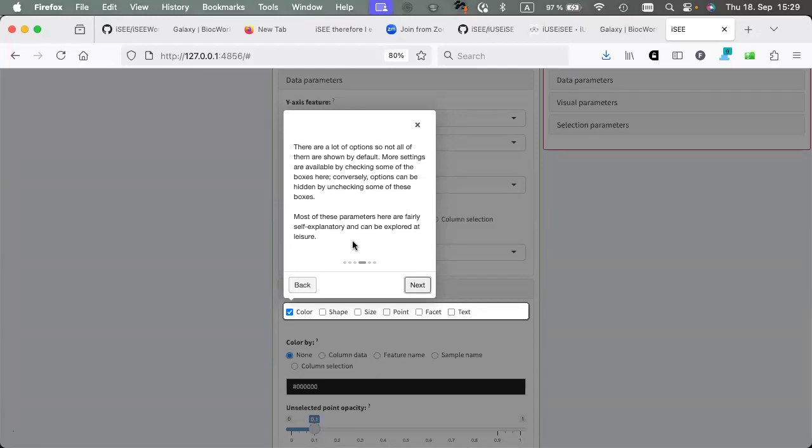I don't give you a static version of the figure. I empower you, so that they don't have to download an H5AD object, a Seurat object, a SingleCellExperiment object, or go to some place, or the GEO, even worse.